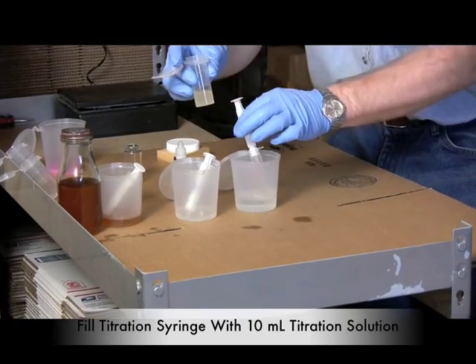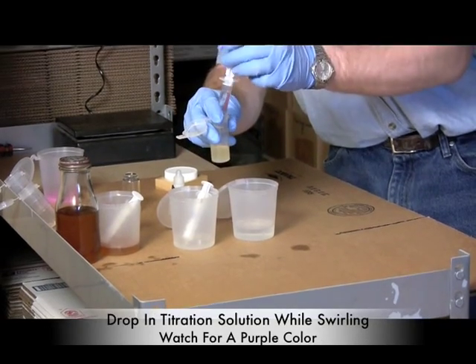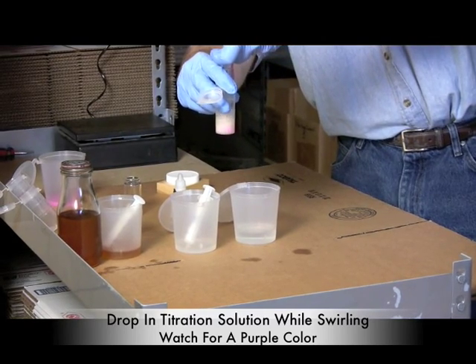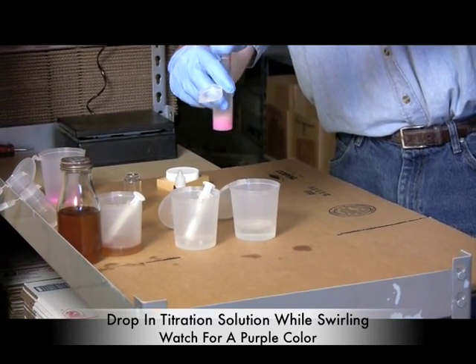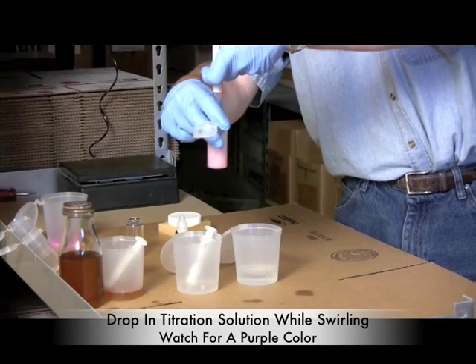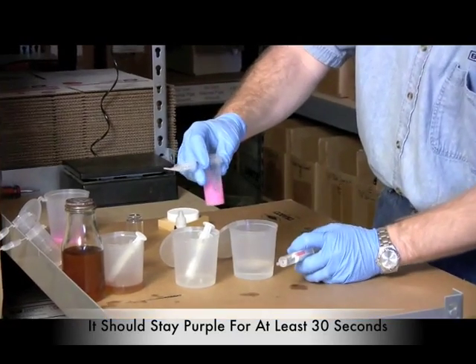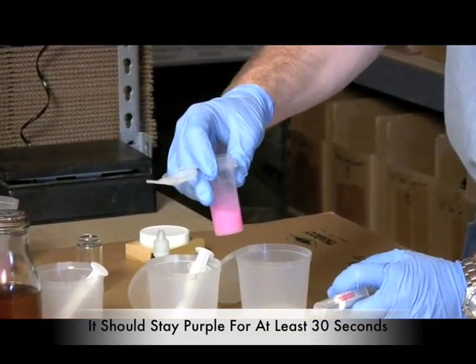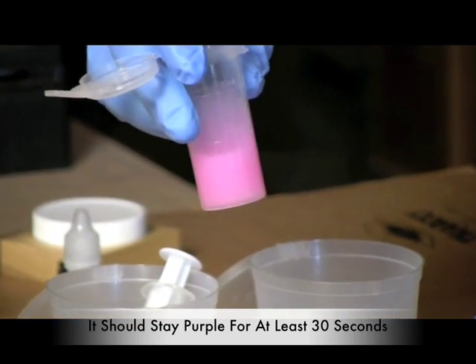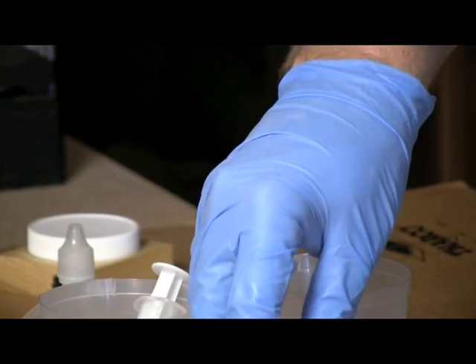With the indicator in place, I have 10 milliliters of titration solution ready to start dropping in. The goal is to identify when the solution changes color and stays purple for about 30 seconds. You can see it's changing and going back to white — there's purple again, and we're almost there. After swirling a bit more to confirm it stays purple, we've titrated.